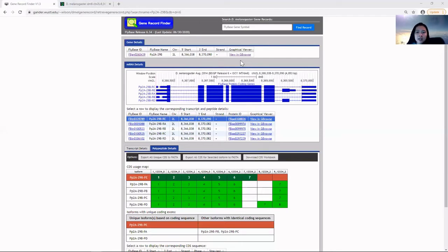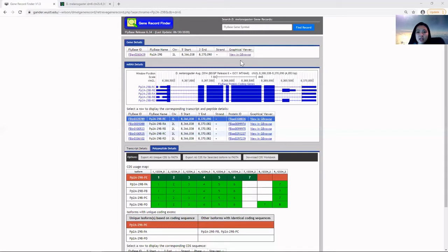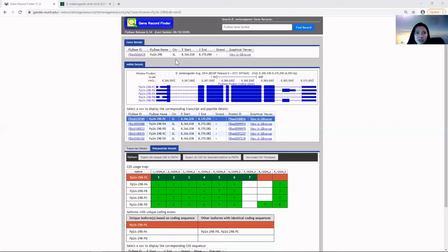It also includes a wide array of other map features that can be selected and viewed along the genome coordinate scale. For this specific gene, we can see it's located on chromosome 2L on the positive strand with its given coordinates.